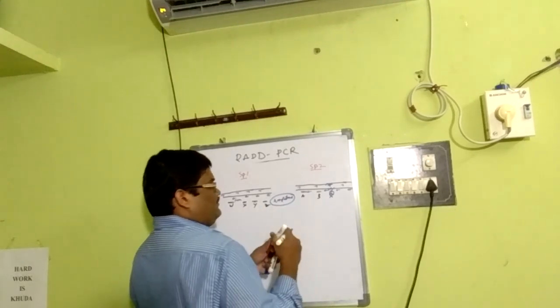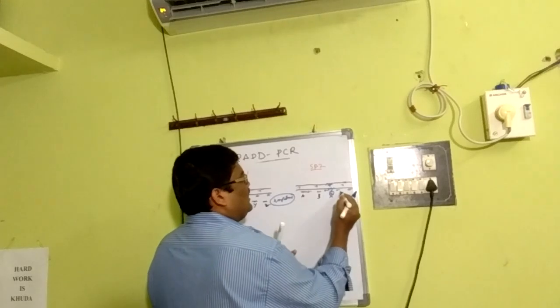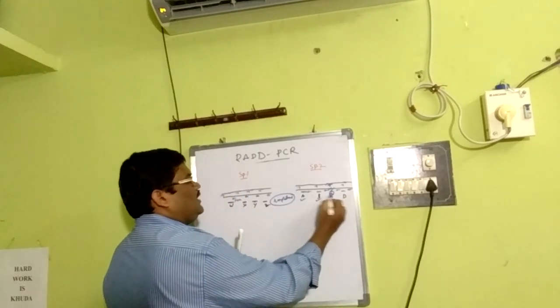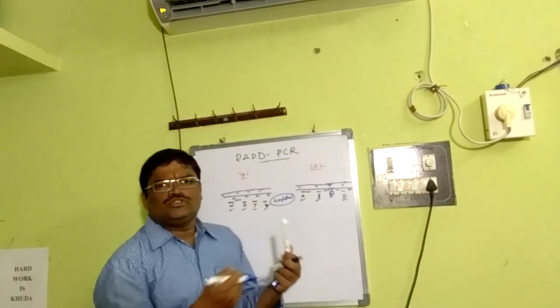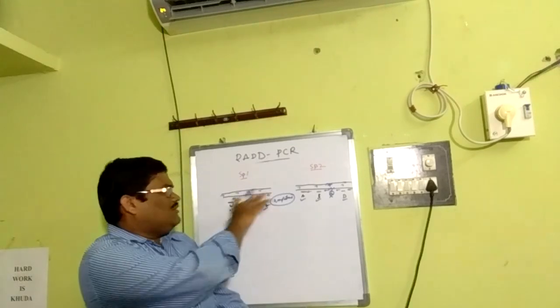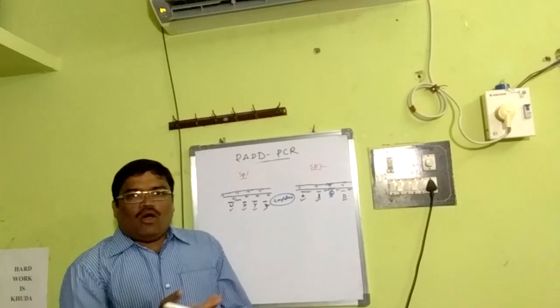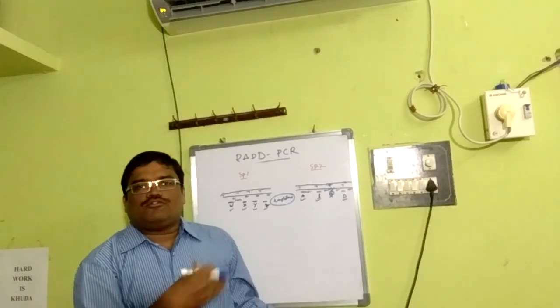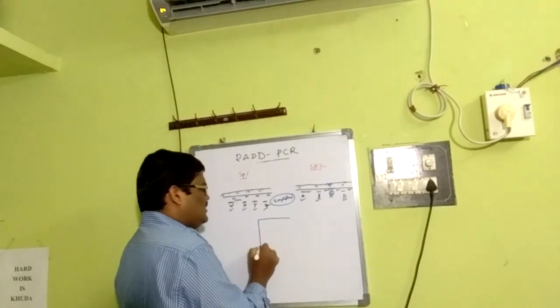But D has the same. They have a D DNA fragment. So in species 2 we have A, B and D. This one we have W, X, Y, Z. So somehow through the PCR machine we got the different fragments. Then we have to analyze. This is very important. How do we analyze? Say first we take the samples to gel electrophoresis, applying the agarose gel. Run the gel.